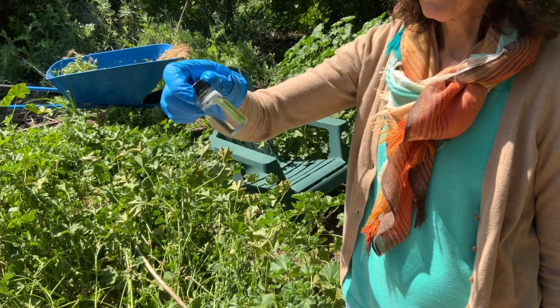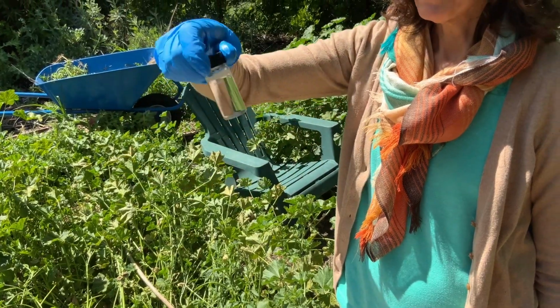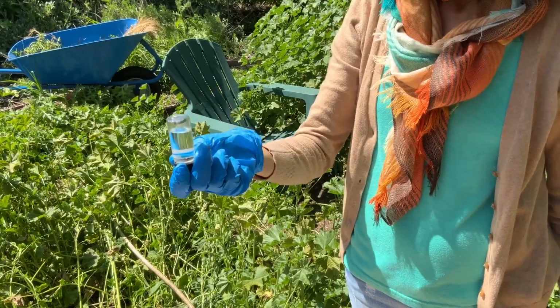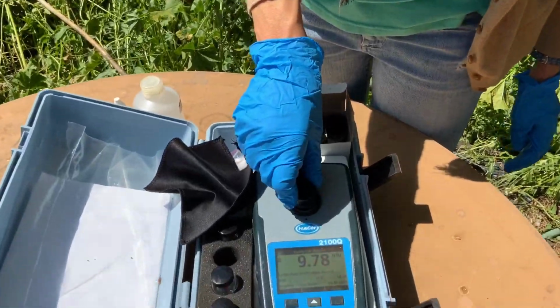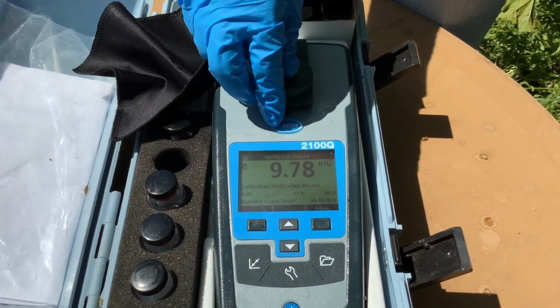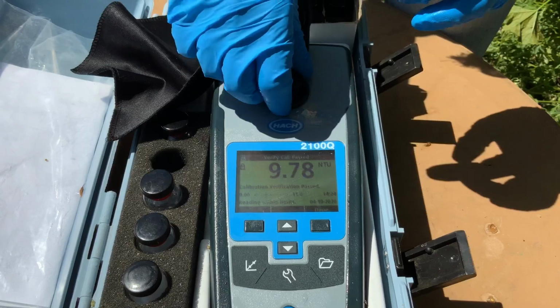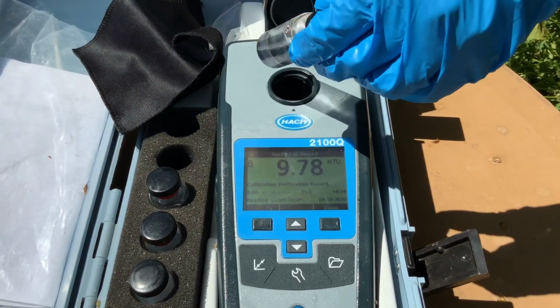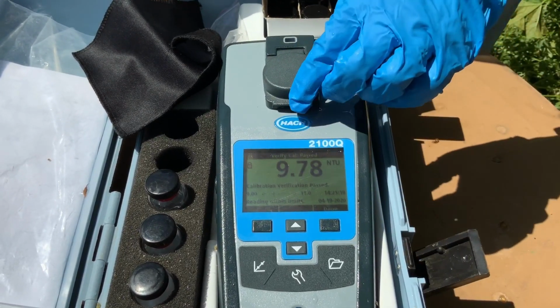So I'm just slowly inverting it and letting the suspended solids get suspended. And when I have done it 10 times, I lost count. Pretend I did it 10. I'm going to stick it back in here and I'm going to press, oh, shoot. I forgot to press done on this last one, so I'm gonna put this back in just in case it needs the verification standard in there when I press done.